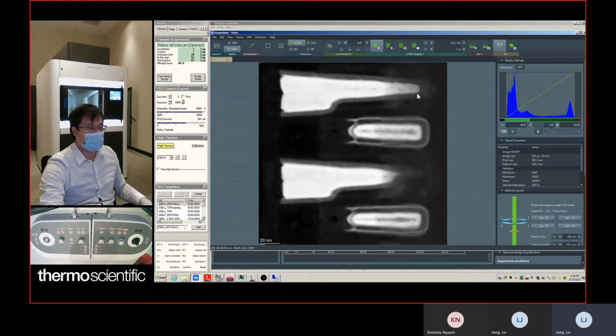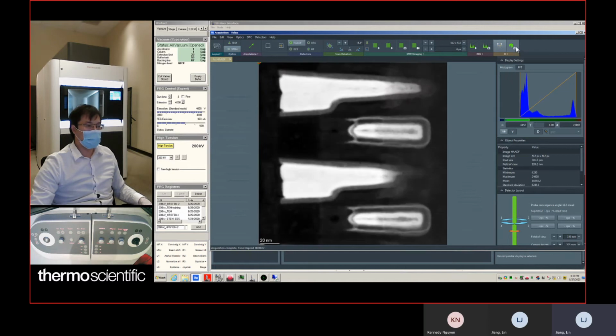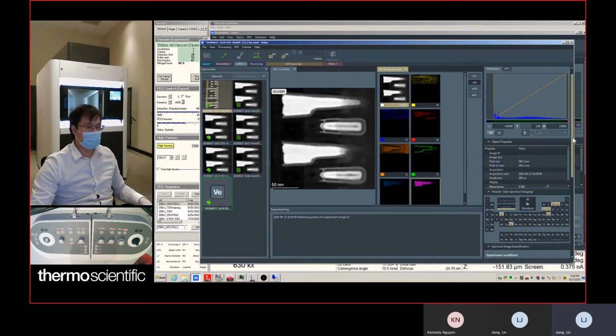You find the stage moves a lot because just now I moved the stage in memory to test whether the function works. Then we can take an image at 200 microseconds. You see how slow the scan is going, but each frame has a lot of signal, so we're able to tell some difference by doing just one scan.